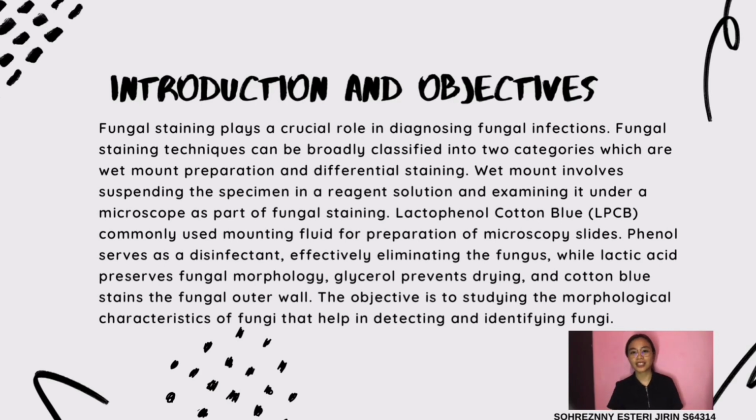A wet mount is a fungal staining technique performed by suspending the specimen in the reagent solution and observing it in the microscope. LPCB, or lactophenol cotton blue, is commonly used for mounting fungi for preparation of microscopy slides. The phenol acts as a disinfectant and kills the fungus. The lactic acid preserves the fungal morphology. The glycerol prevents the sample from drying, and the cotton blue stains the outer wall of the fungus.